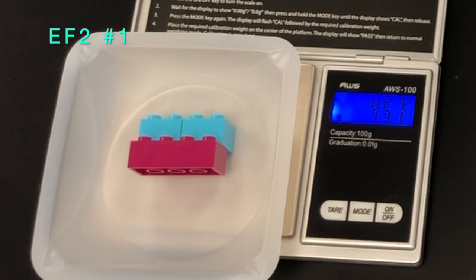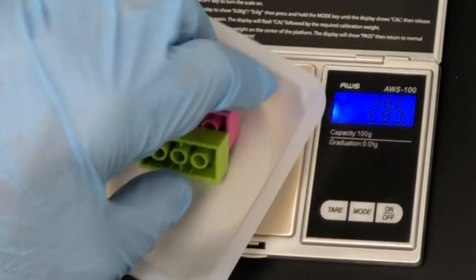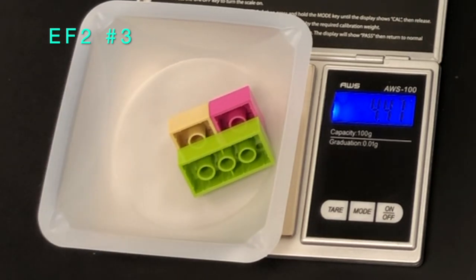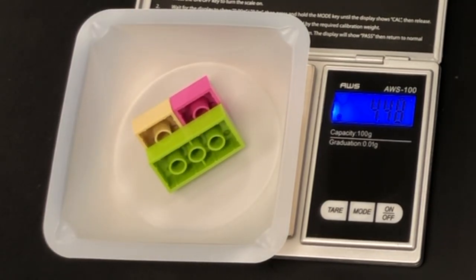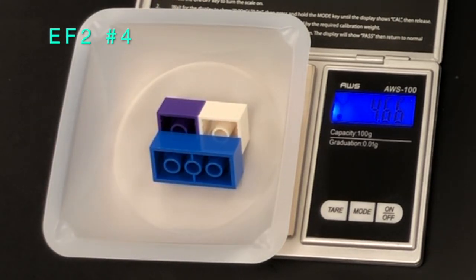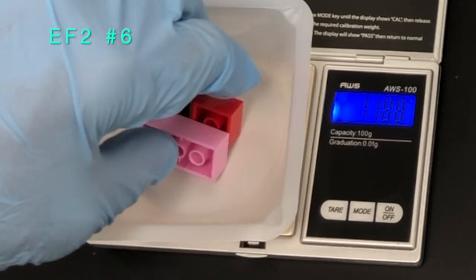Finally, one two-by-four brick and two two-by-two bricks are assembled together — this is what we call the EF2 molecule, similar to water which has two hydrogens and one oxygen. You will see the weighing of each individual EF2 molecule. At the end, all ten EF2 molecules are placed on the weighing boat and the total mass is displayed. Take that total mass and divide by ten to get the average mass of one EF2.